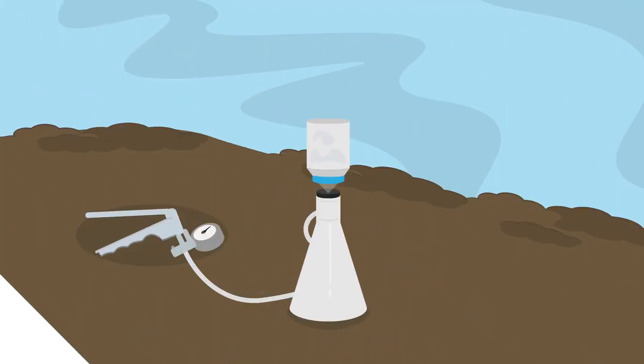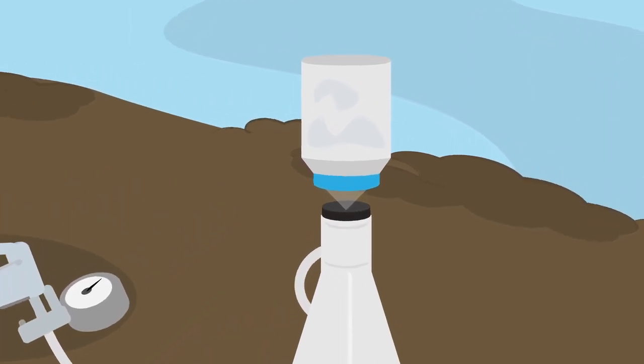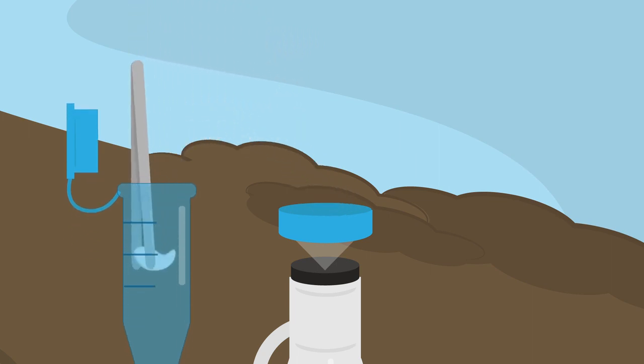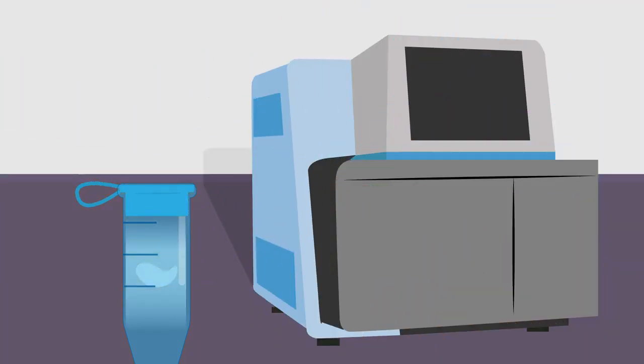In standard eDNA collection, a motorized or hand-powered pump is used to force a water sample through a DNA-capturing membrane. The filter housing is then opened, and using sterilized forceps, the membrane is carefully transferred to a vial. Finally, ethanol is added to preserve the captured eDNA while it's transported to a lab for sequencing or PCR detection.